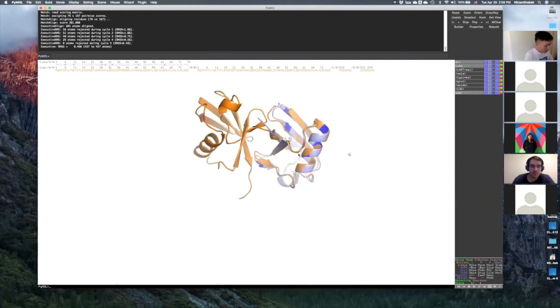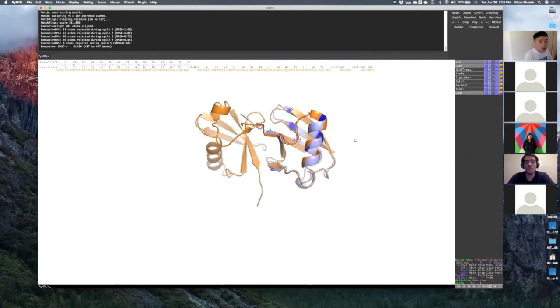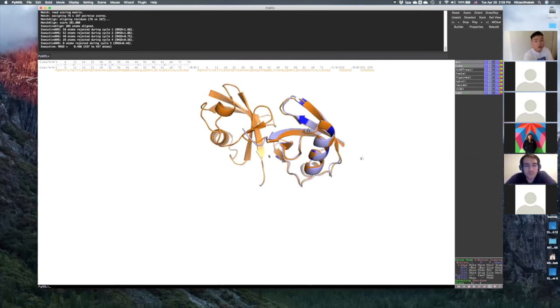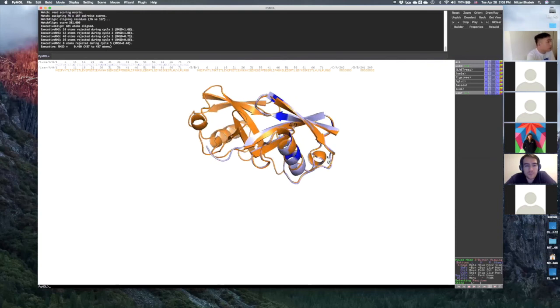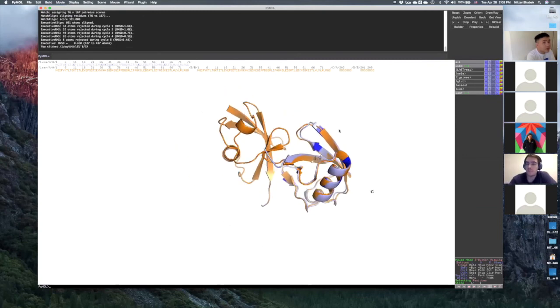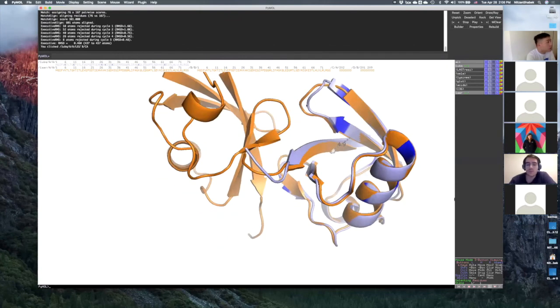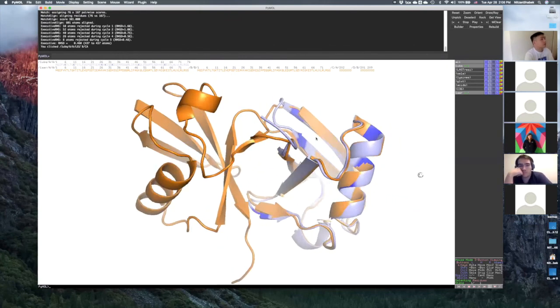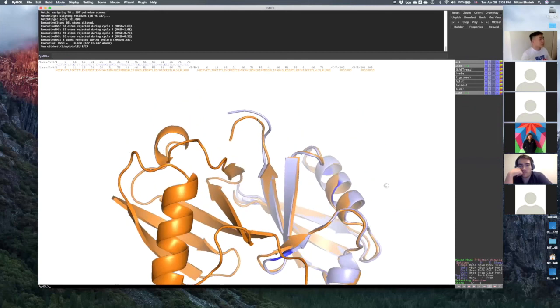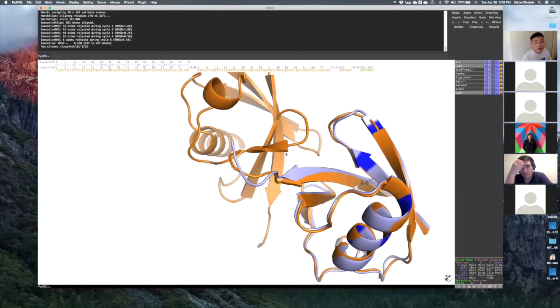We can say, hey, one ubiquitin, when it's bound in a polyubiquitin chain, there are some things that are not perfectly aligned, right? You can say, well, this loop might be a little bit different, and maybe this loop might be different. But to be honest, there's not much change with ubiquitin, because in crystallography, there are some very minor changes between different parts, and that's okay. You can see that this angle here probably happened because now it's creating the bond, and here there's no bond, so it's more free. And we know that this C-terminal is pretty flexible, okay?